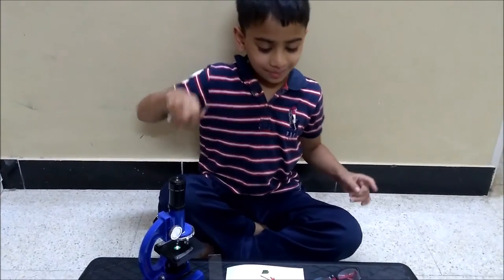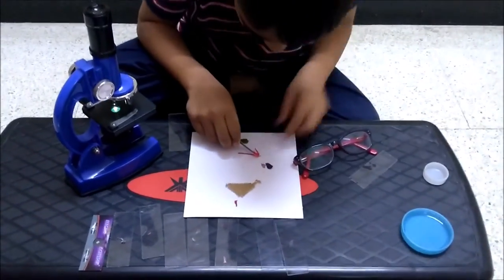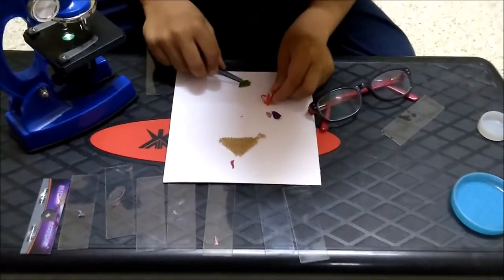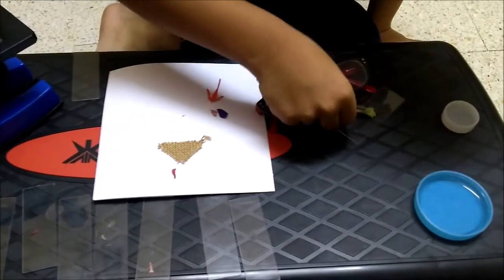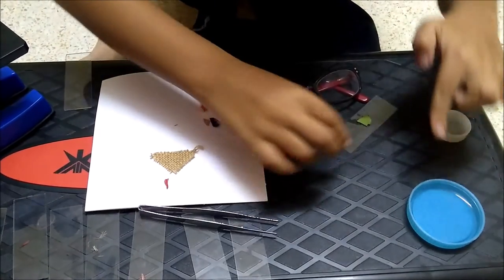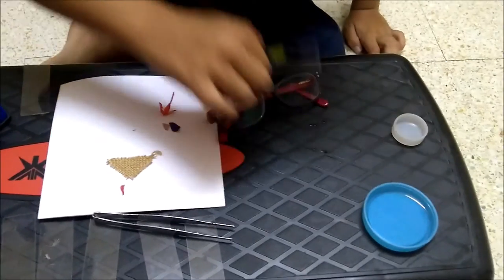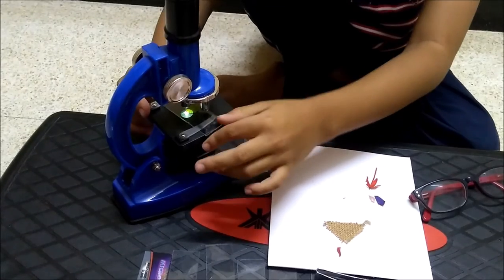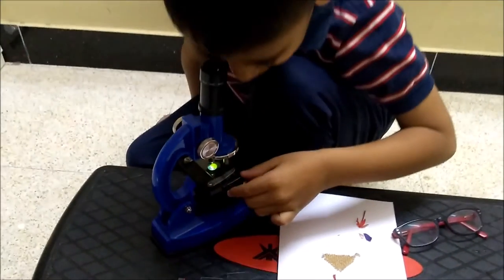So how to make a slide: first take your sample, then place it on your slide, put some water, and put it over here below the microscope and adjust until you can see.